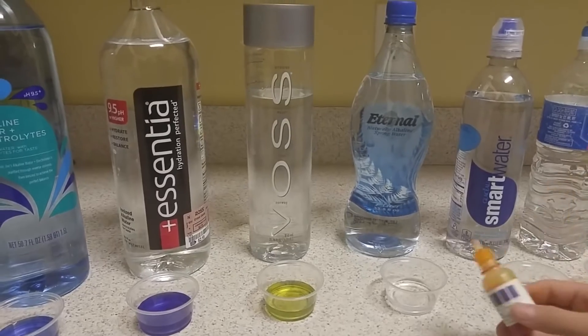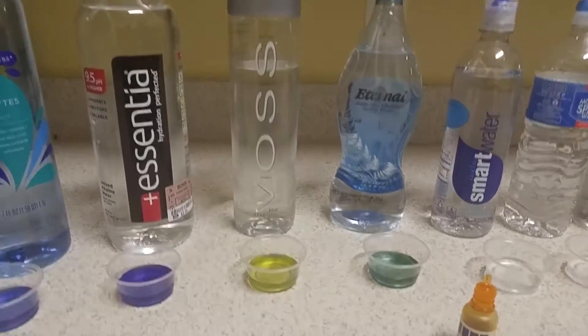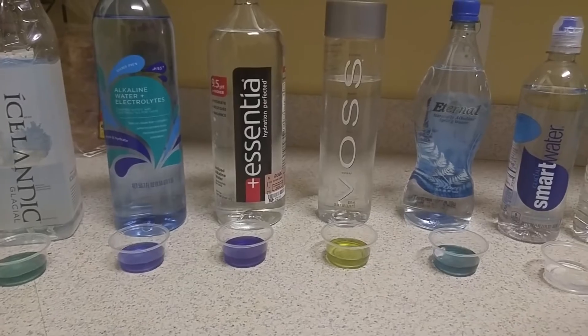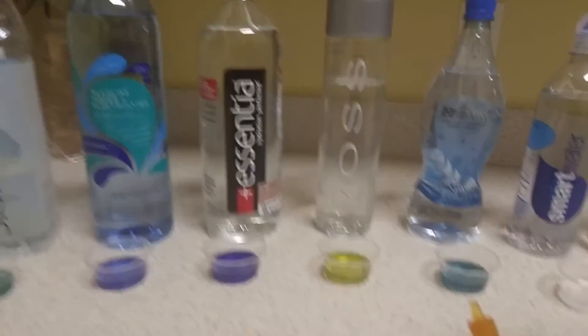Let's go to Eternal. Comparing that to the other ones, it's a little bit darker than Icelandic, and it's starting to turn blue. So that's definitely alkaline.